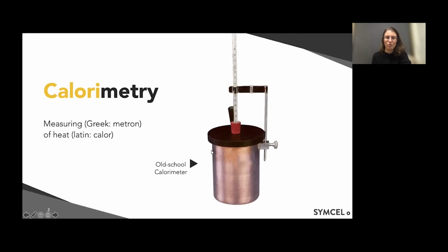It is a calorimeter, and we had to add substances and then manually note down the temperature at given time points. At that moment, I thought this is a very laborsome technology, and also I found it complicated and thought I will probably never use it again for my former research in biology. Obviously, I was wrong.